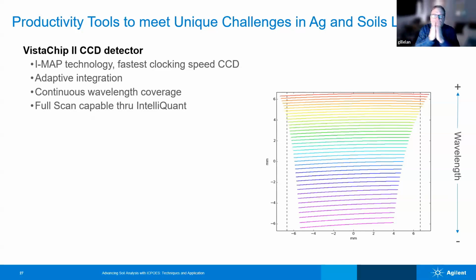What this does is it splits out the wavelengths and splits out the orders, so that essentially you have a situation where each one of those lines you could line up with itself. There'd be some overlap, and then the whole thing would be a tremendous spectrum that would be like 30 feet wide. So this is amazing spectral resolution. It's a terrific optical system. So that is why you see that shape. That is why our detector is built that way.